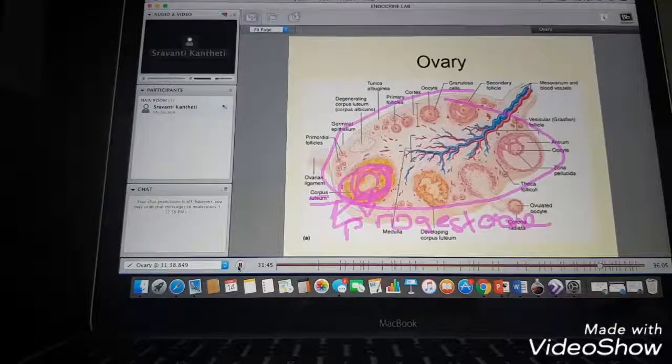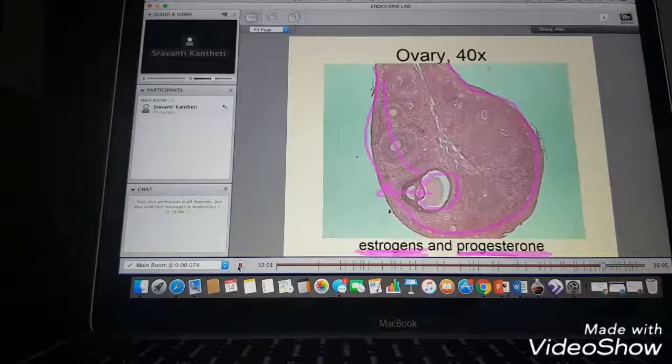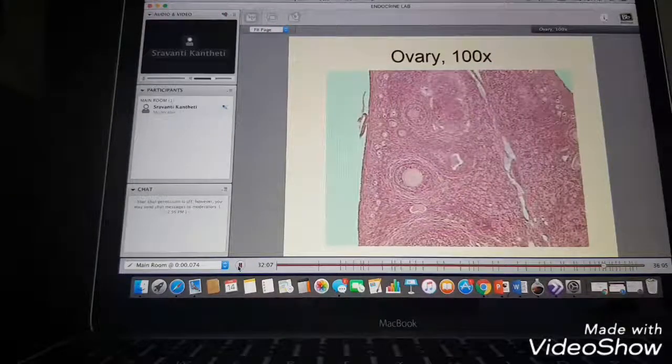It's showing a whole bunch of cells in different stages. I don't see, oh, here it is. So it shrivels up and dies and becomes white, and that's now known as the corpus albicans. So you can see a different stage of all the eggs here in your ovary where that is happening. So see little bitty eggs, how cute. And that's the big corpus luteum.